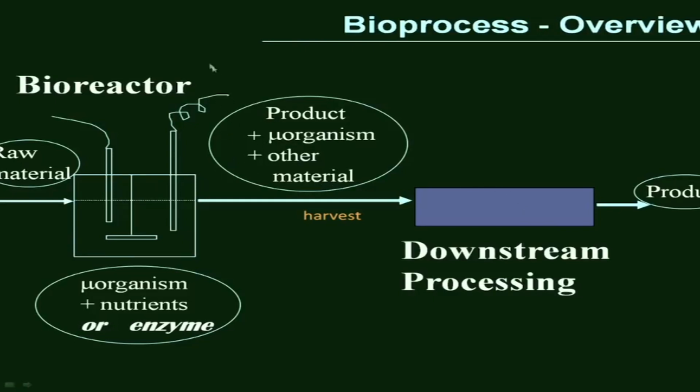This course will focus on the upstream side or the bioreactor side. Downstream processing, of course, is very important, but we need to focus on something to get something useful out of whatever we are doing, and we are going to focus on the bioreactor aspect or the upstream aspect, and that is why this MOOC is called Bioreactors.